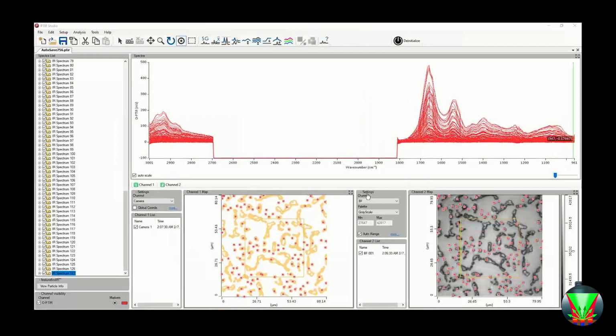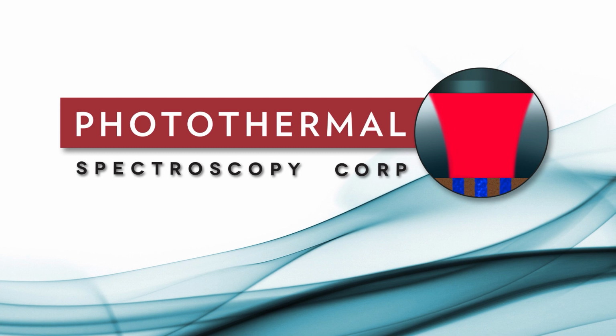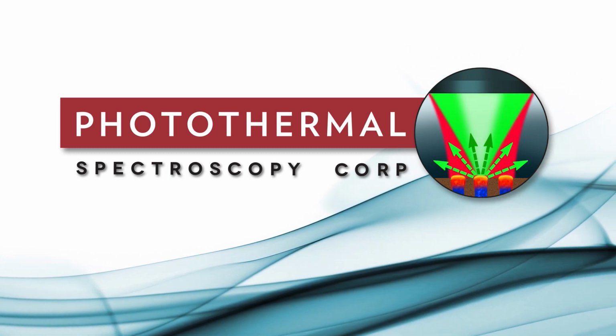Back in the document view, we see all of our spectra, our segmented image, the protein IR image, ready for easy sample interpretation and further analysis. And that concludes our quick 3-minute sub-micron infrared bacterial, spectral and imaging measurement demo. Thank you.